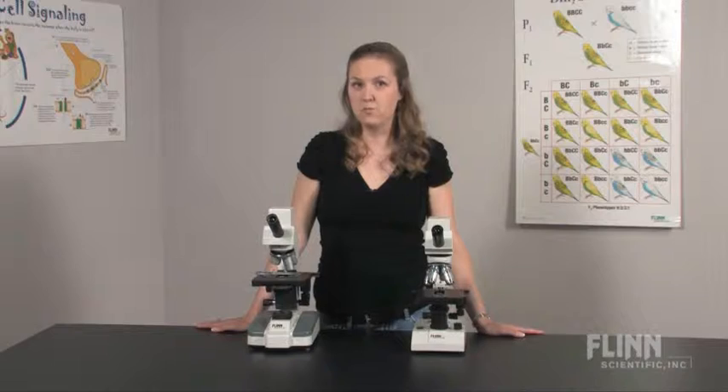Digital Microscopy is here. The two Flinn Digital Microscopes are based on our popular sturdy compound microscopes.